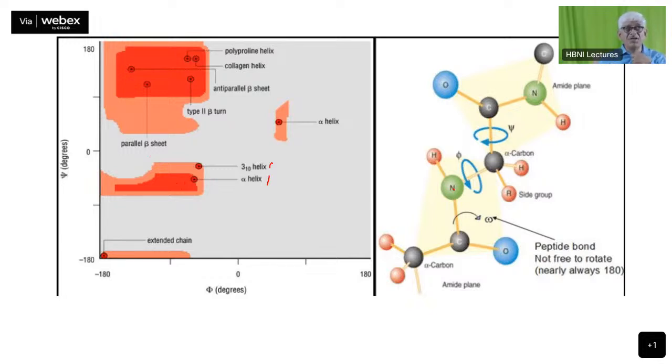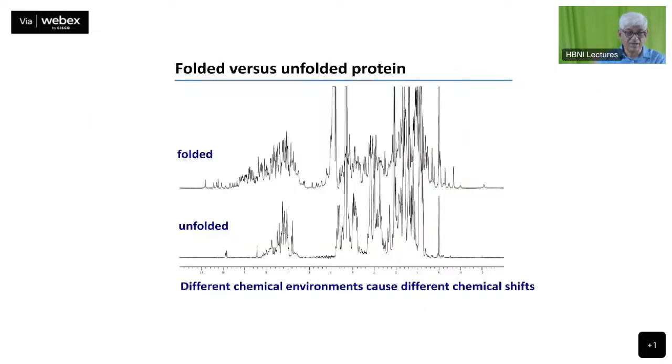So therefore, if you determine a structure, whether it is by crystallography or by NMR, it has to satisfy these constraints. If it does not satisfy, then it is not a correct structure, you made a mistake in the structural determination, or there is a strong reason which provides stabilization to that combination of torsion angles. So therefore, you will have to provide that answer. Okay, so now with that introduction to the structures, now we turn to the NMR applications.